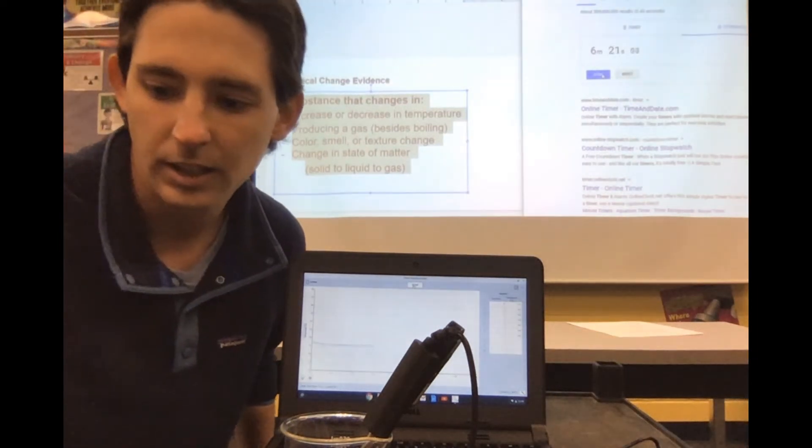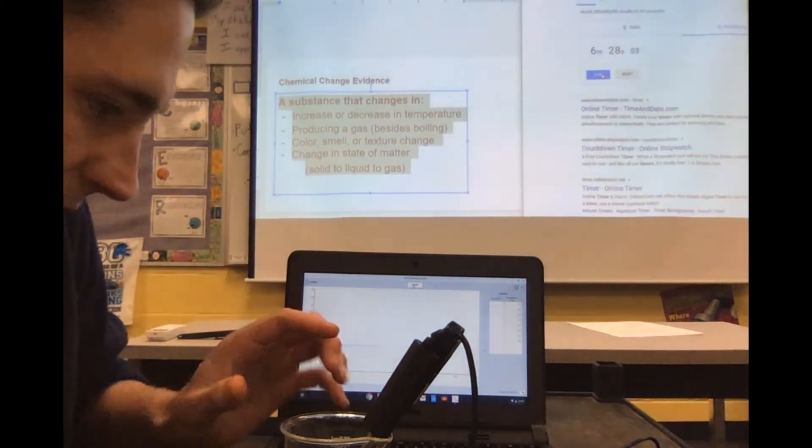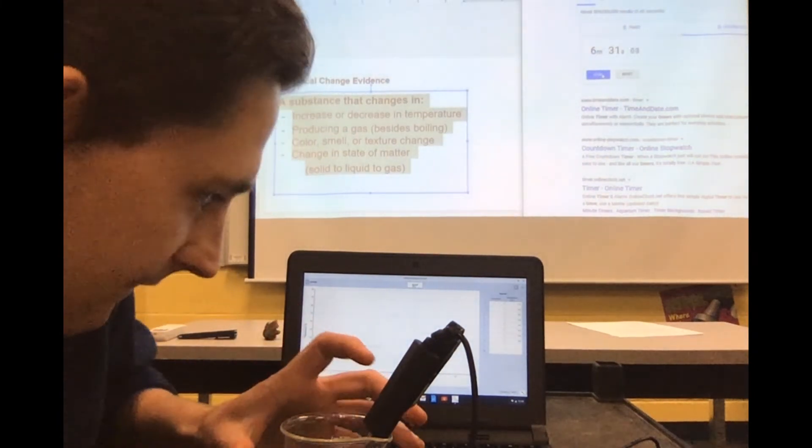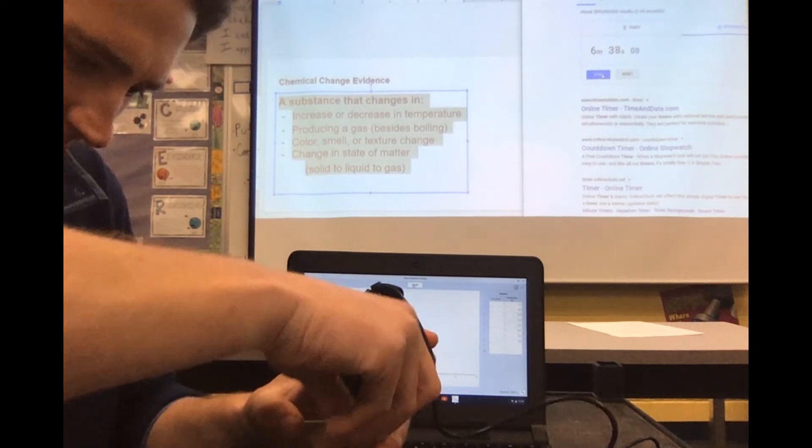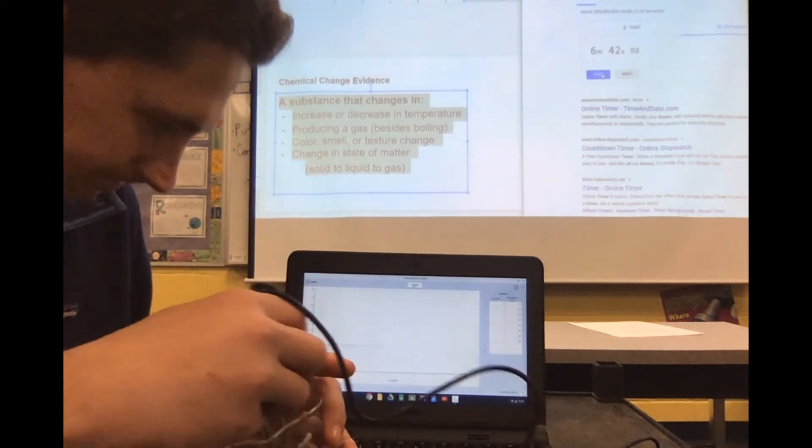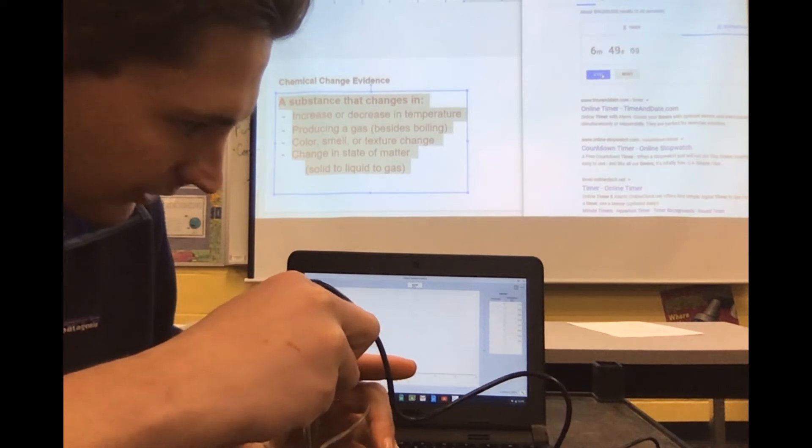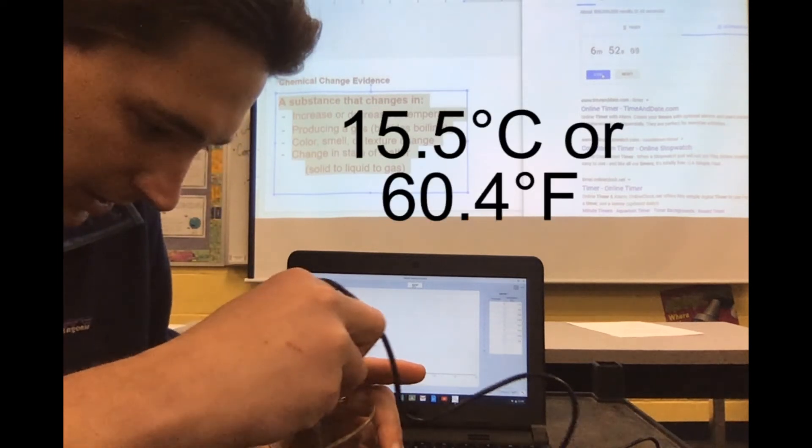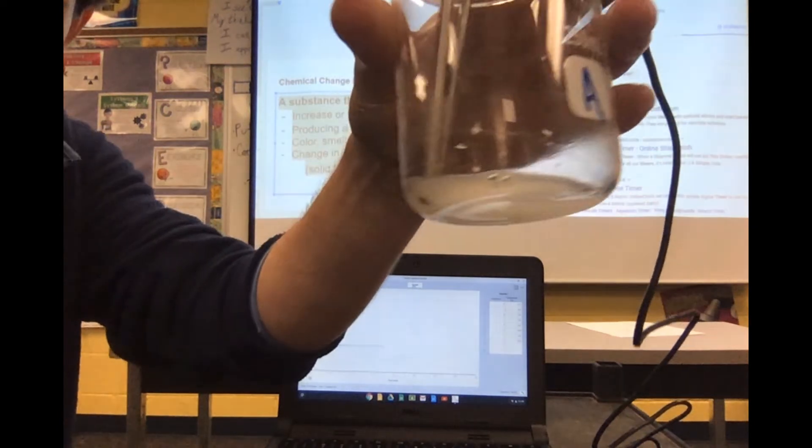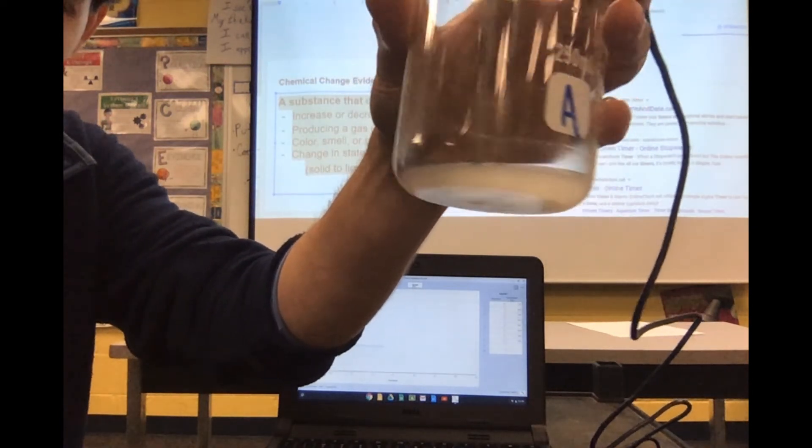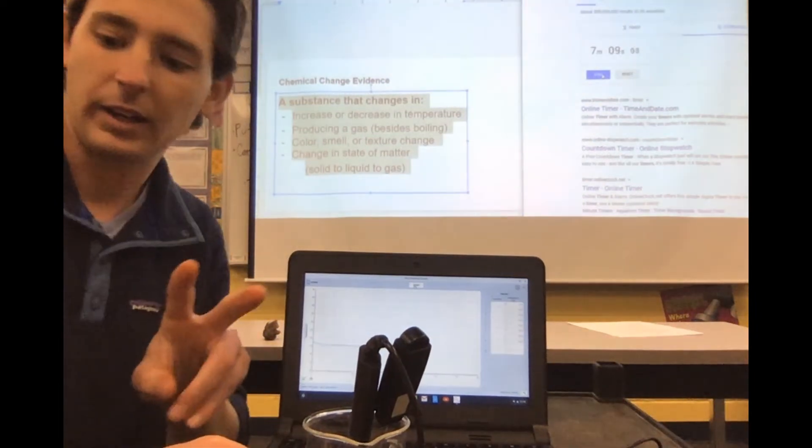All right I'm back. Let's read the information: 60.4, 15.5 it appears. Make your observations. Getting a little more liquidy or solid, getting more thicker I would say.